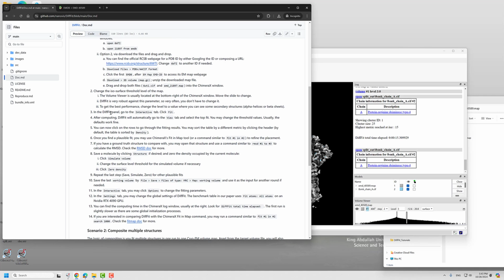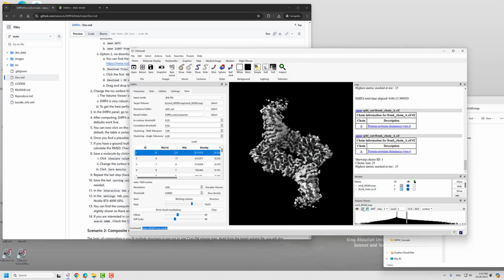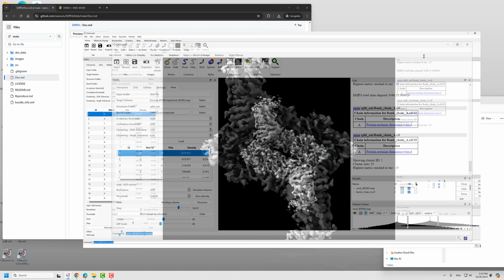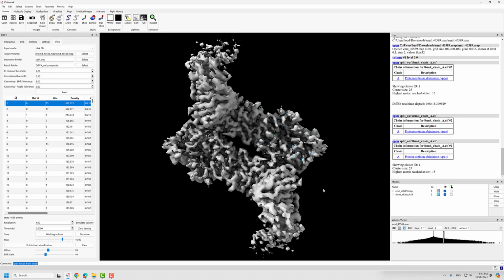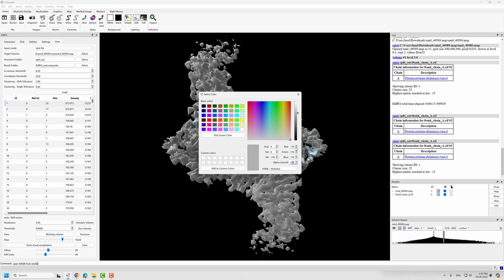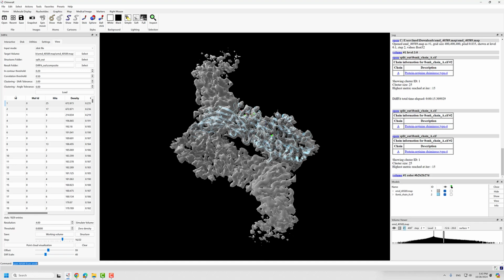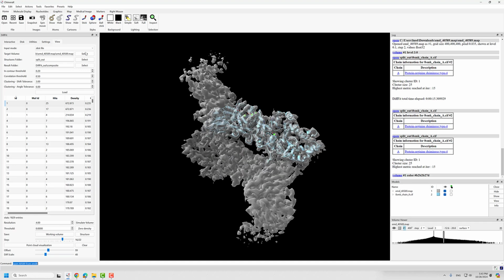That's at here. Yeah, we start clicking the rows and go through the fitting results. So this, you can maximize the window. You can change the transparent level so that we see where the structure is.